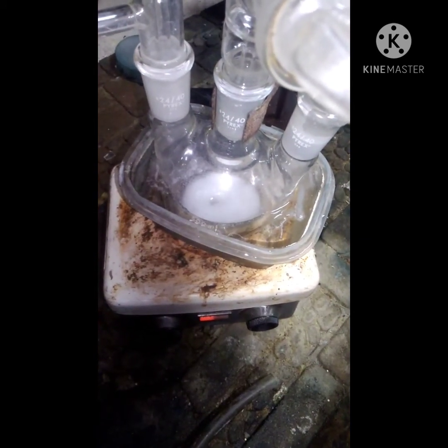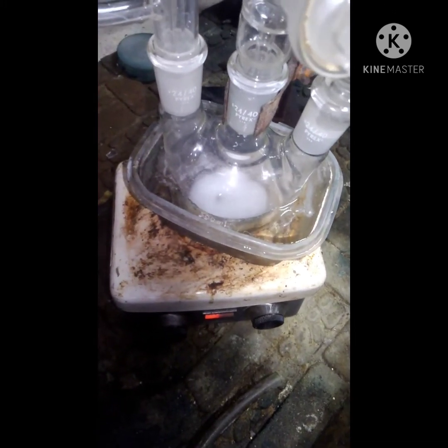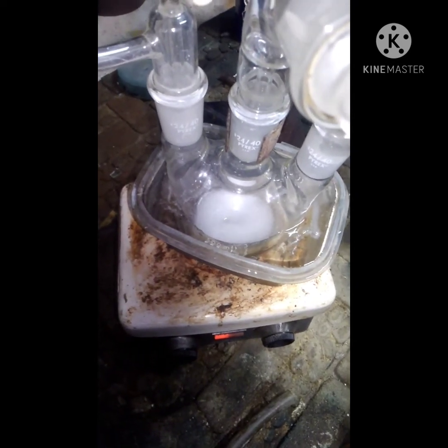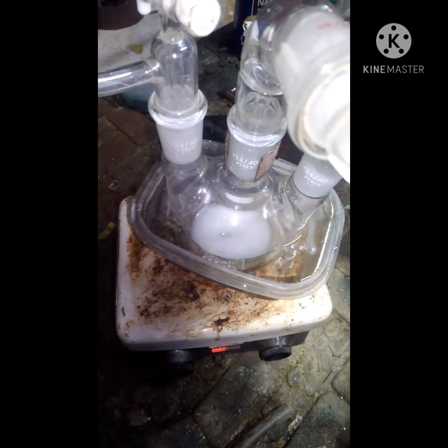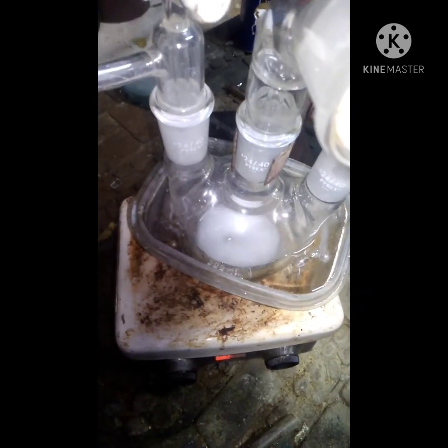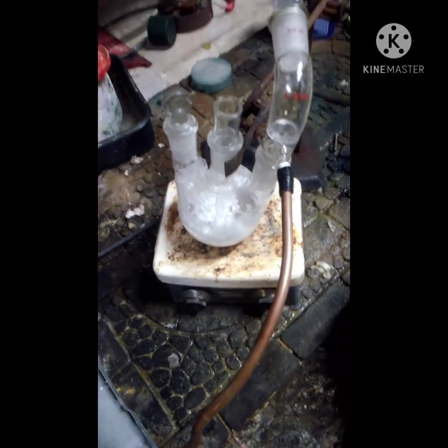The acetic acid finished going in about five minutes ago, and as you can see the hydrogen is still bubbling off. It's just going to keep bubbling away until it's done, and I'll be back when it stops.